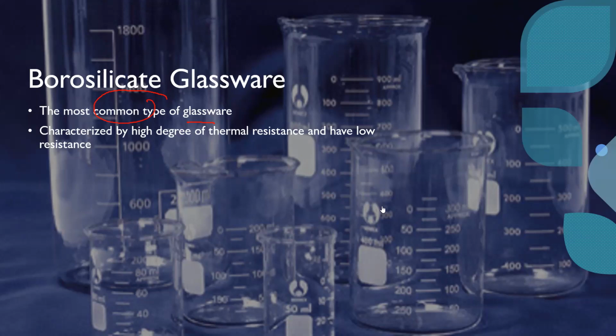Aside from that, it is characterized by a high degree of thermal resistance, meaning even though you use it at extremely high temperature, it will not break.